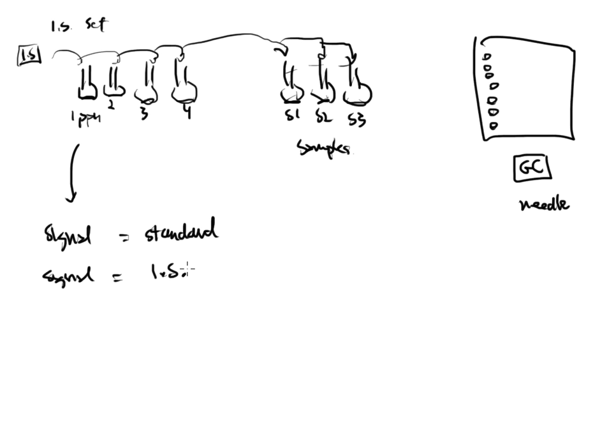Okay, well, going back to a previous example, let's say that we are analyzing benzene in gasoline. All right, so benzene is a 6-membered ring with a couple of double bonds on the inside. And let's say we don't do gasoline. That's too complicated. To pick out an internal standard that's not going to be present in gasoline is going to be pretty difficult. All right? The standard addition process would work much better for that. So let's say that we pick out benzene in a vitamin C soft drink.